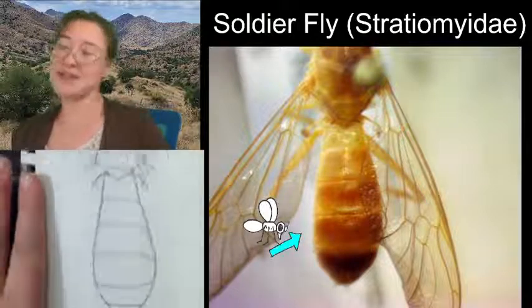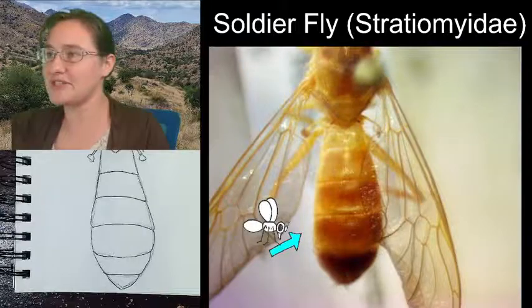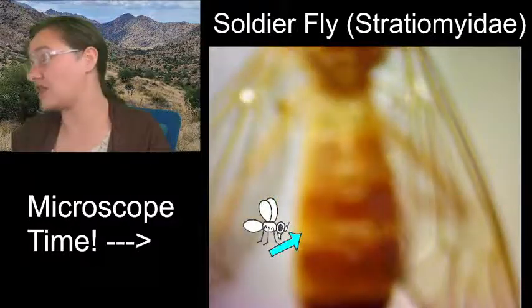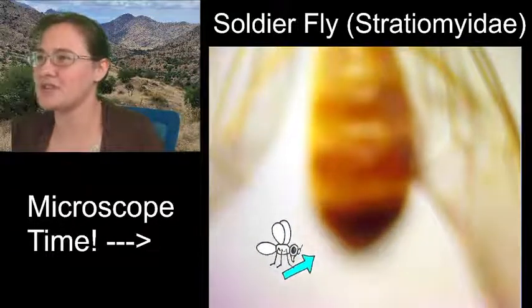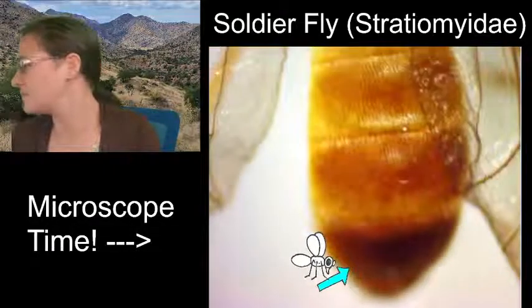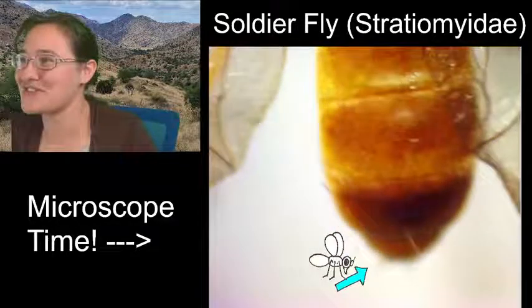Alright, we have the body taken care of. There are two little cerci on the end of its abdomen. Or at least, I believe they would be called cerci. They've got to be called cerci. C-E-R-C-I would be the name. Not C-E-R-S-E-I like in Game of Thrones.